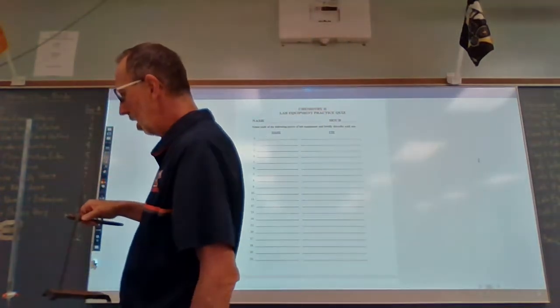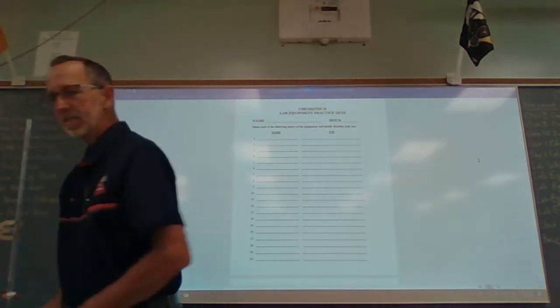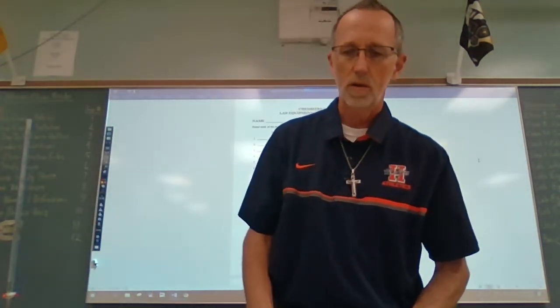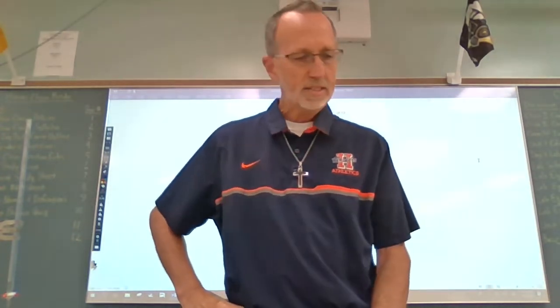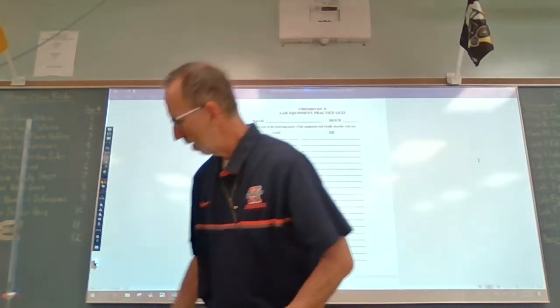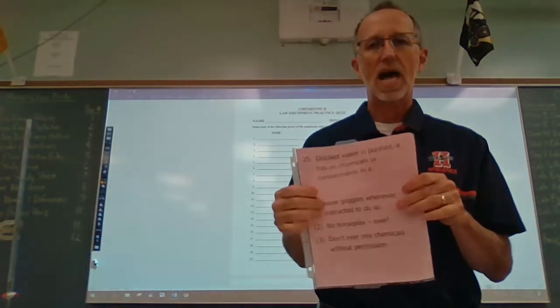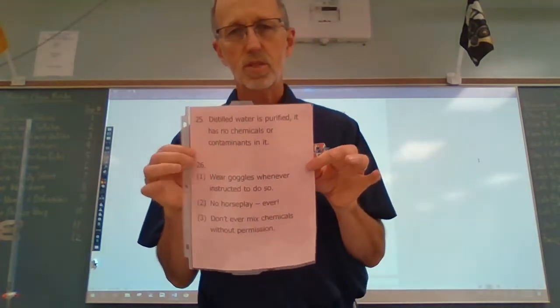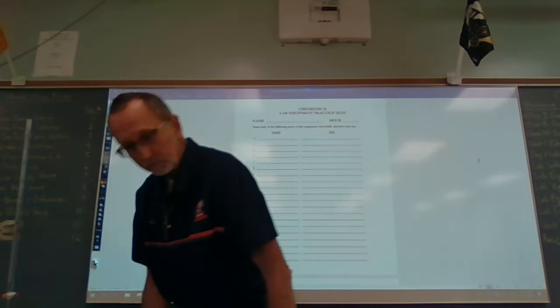And that takes care of the 24 pieces of equipment that you need to know and be familiar with, because we're going to be using them very often throughout the year. The last two questions, there's two more questions on the quiz that you were to answer as you were to go about the room and look at all the pieces of equipment live. I had this sitting over there too, which answers these last two questions. We'll go over them right now.